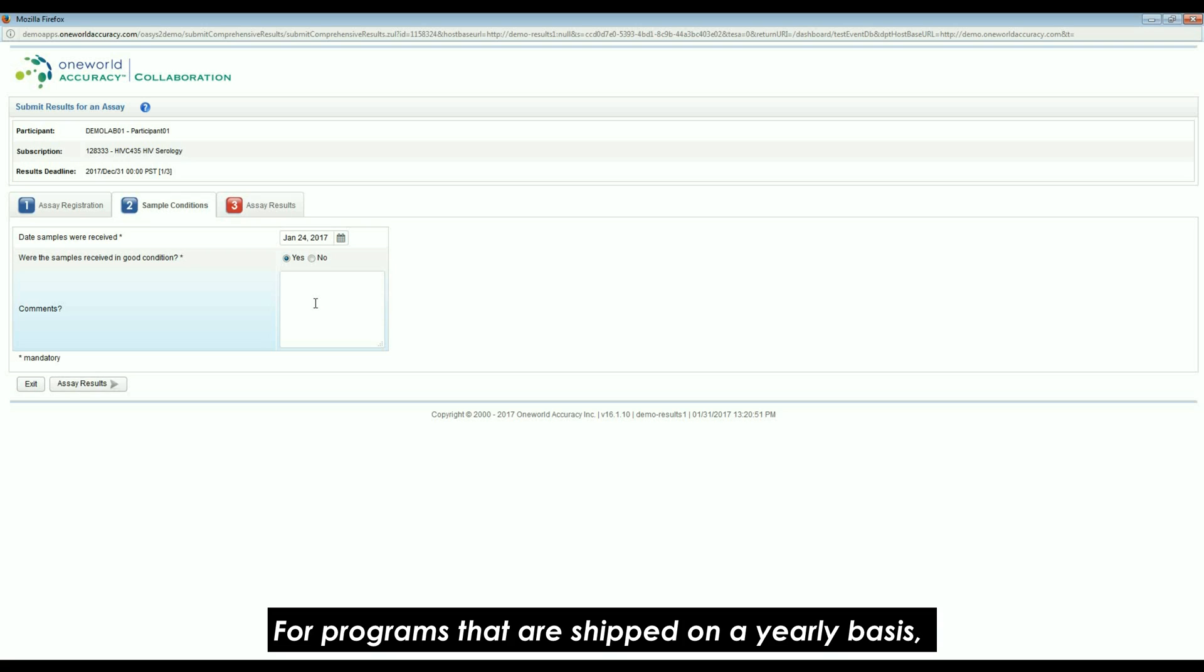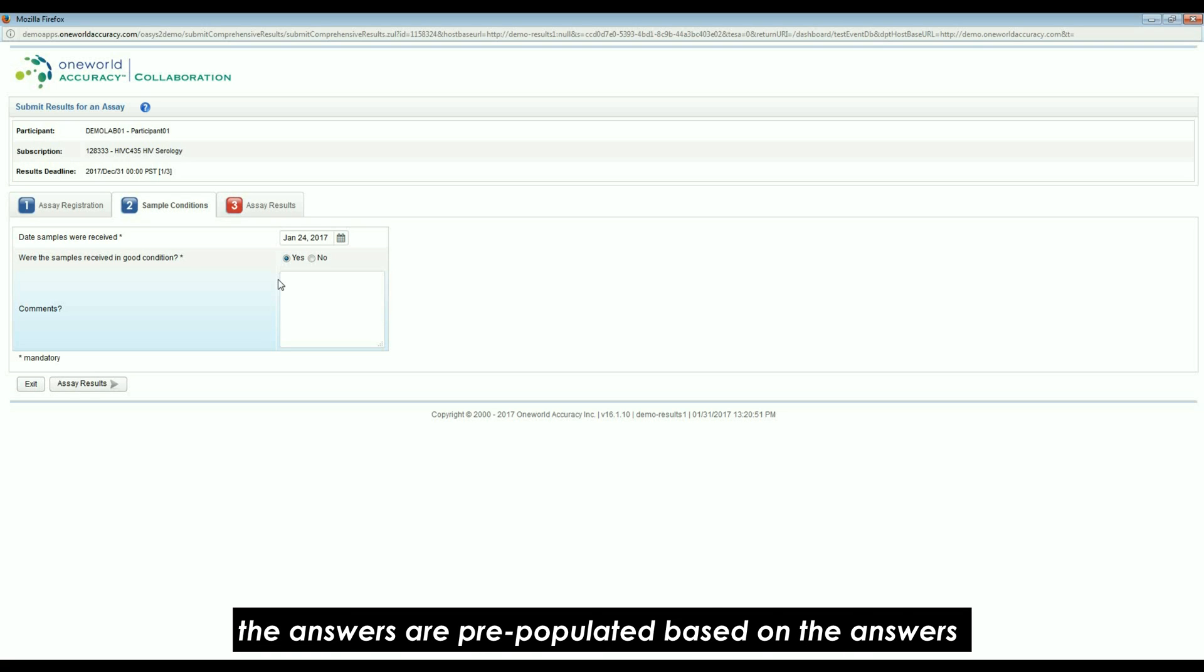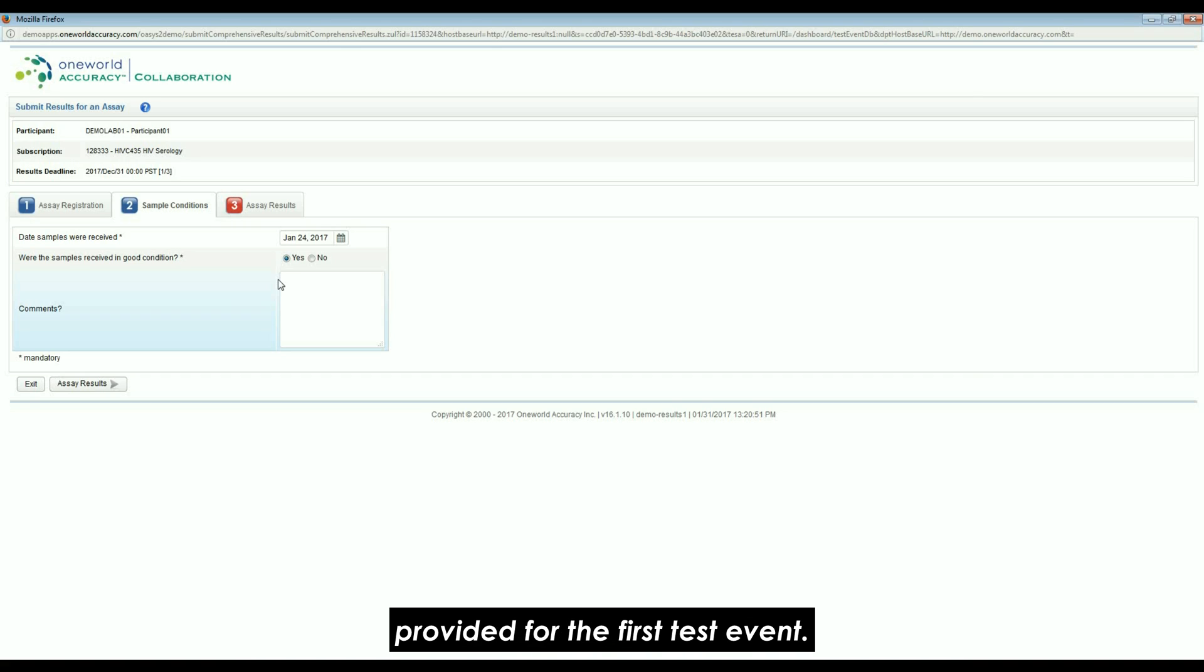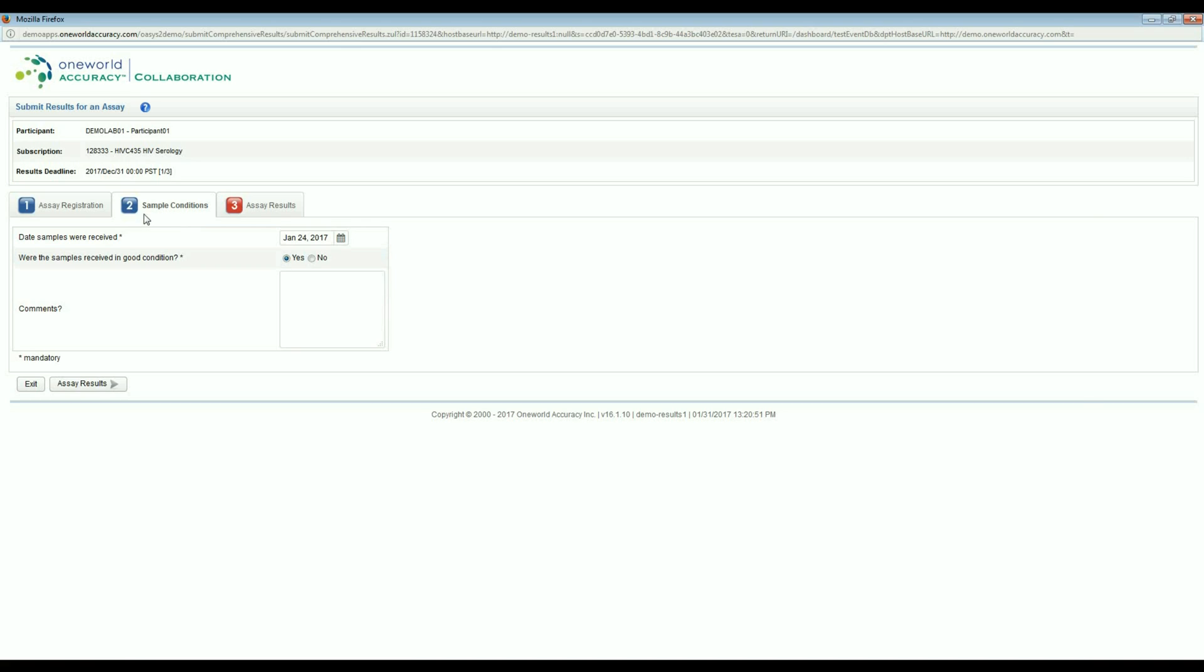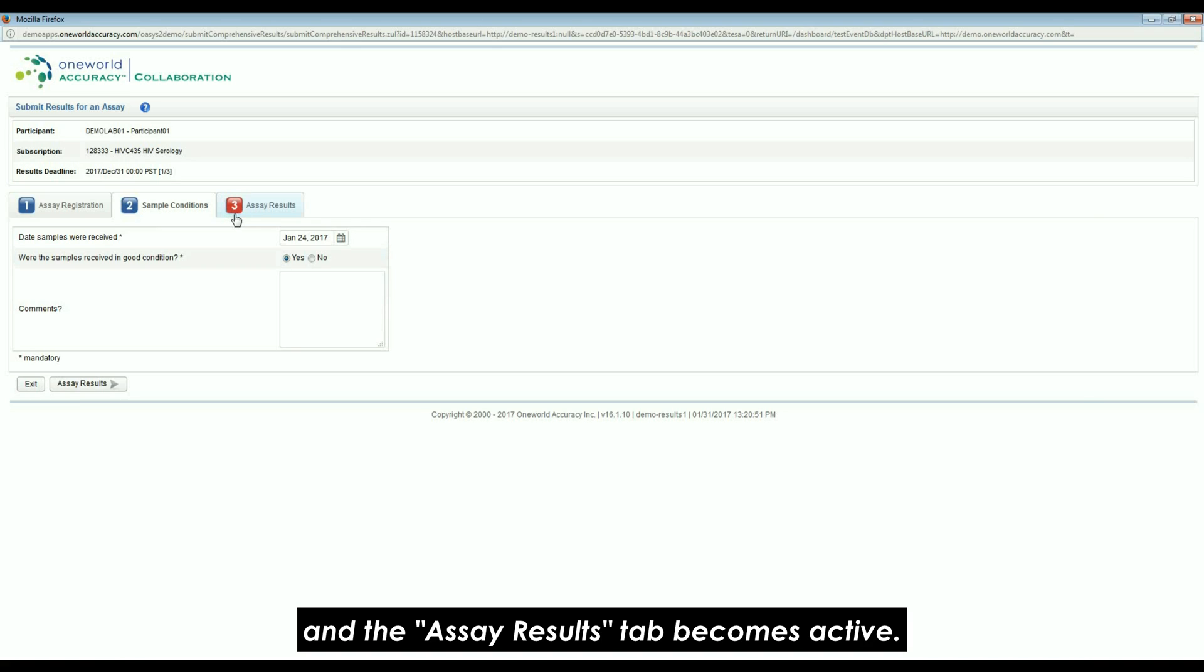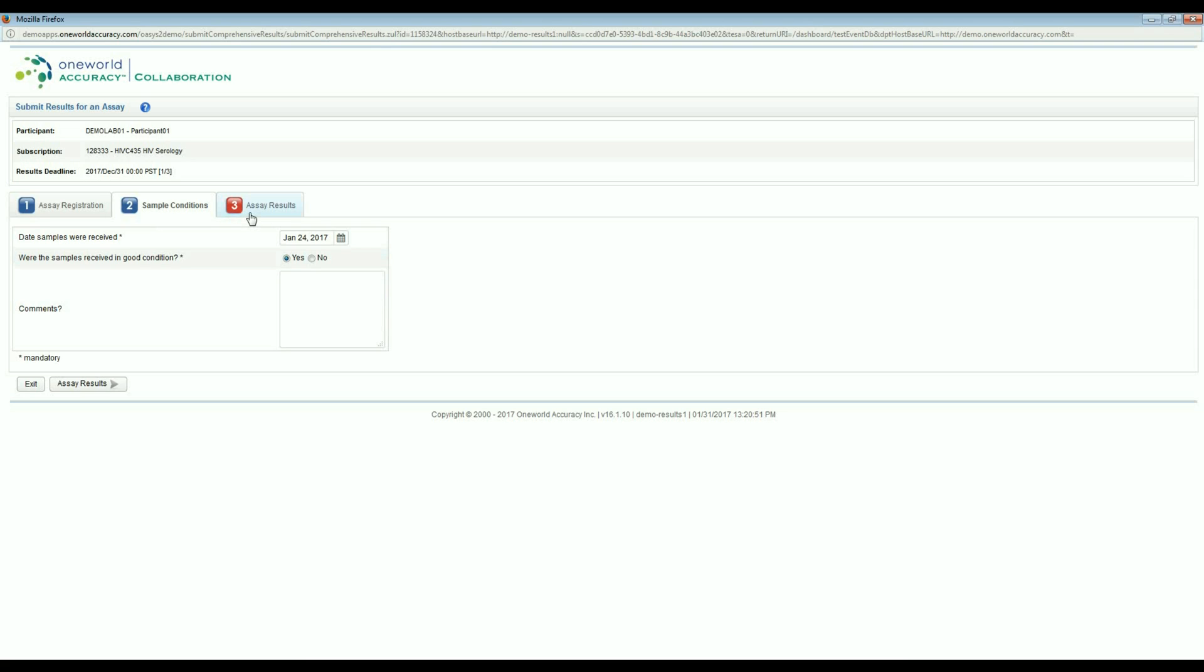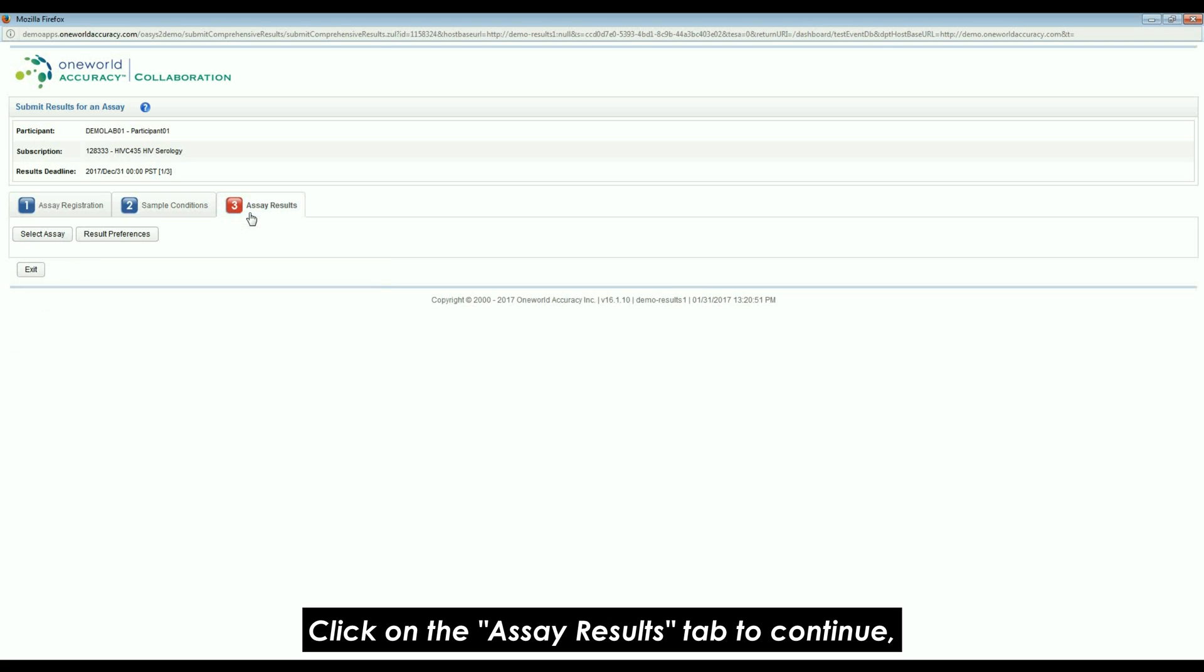For programs that are shipped on a yearly basis, the answers are pre-populated based on the answers provided for the first test event. Once all mandatory questions have been answered, the tab turns blue and the Assay Results tab becomes active. Click on the Assay Results tab to continue.